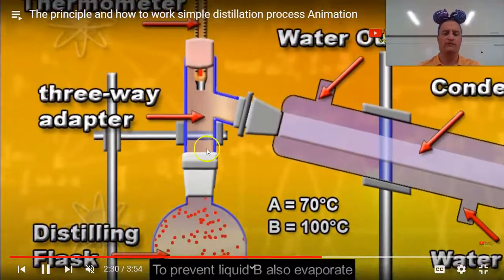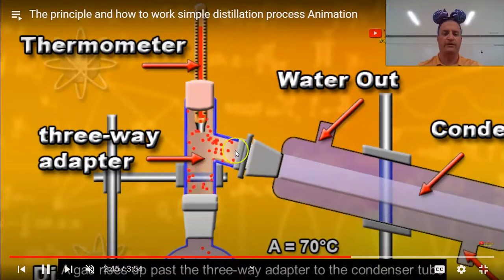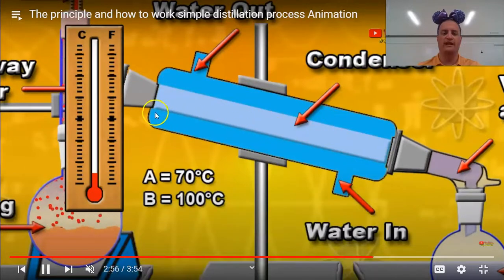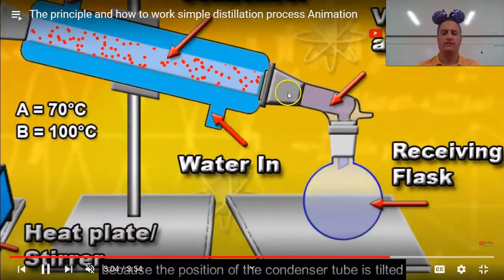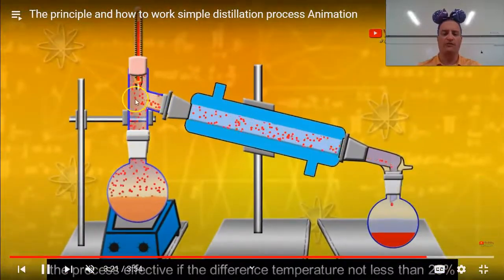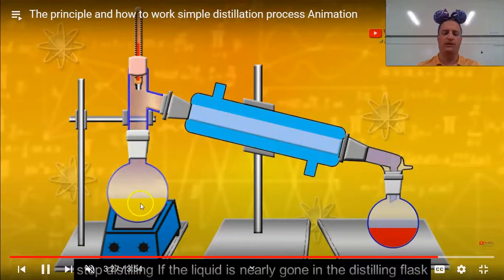Get it going, get it boiling, evaporate. You have it collect in here, increasing the thermometer, the air temperature here. It's going to increase, and then as it slowly moves into here, this constant water running in and out is going to cool down the gases that come through here. Slowly, this would start to condense and cool down, in which it would be caught in your receiving flask, and that would be all of the first component, because this would be carefully kept under 100 degrees so this doesn't boil off.